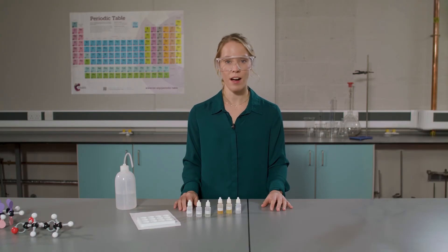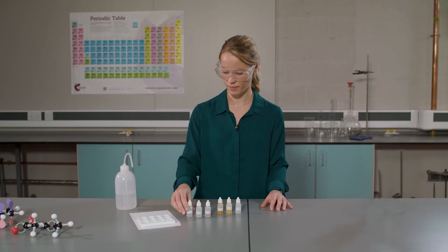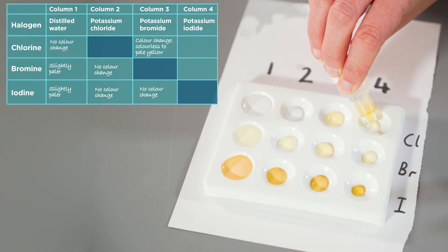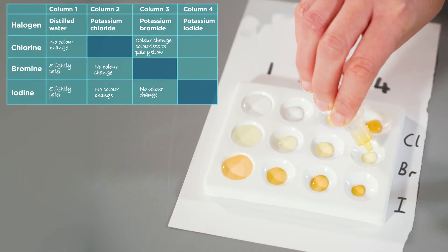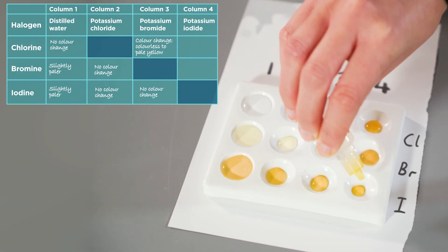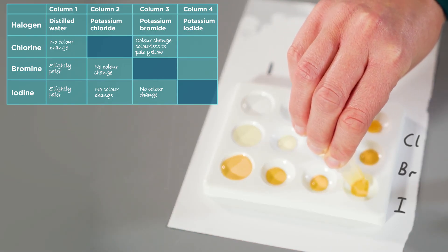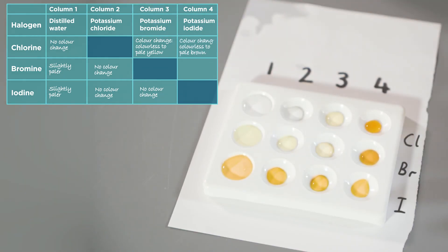Finally, I will add potassium iodide to the fourth column. Carefully observe and note down any changes.